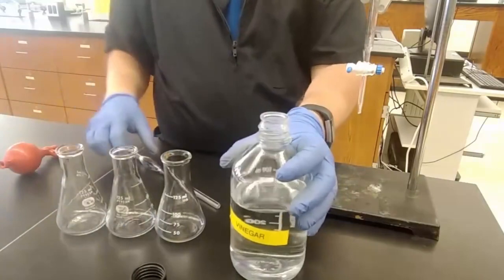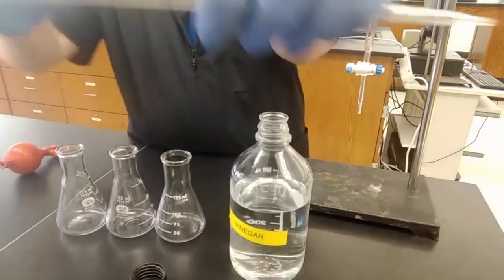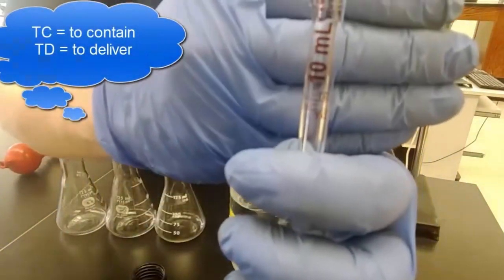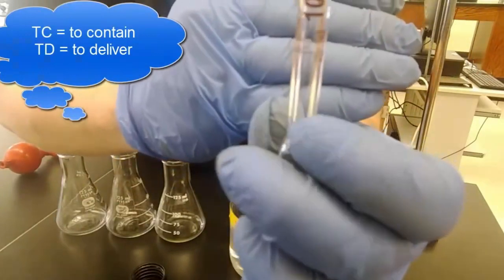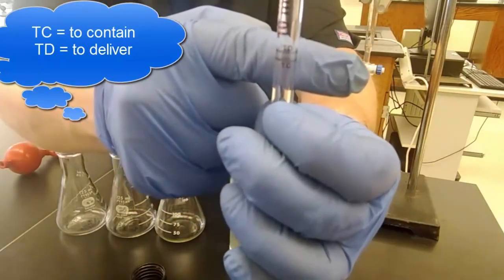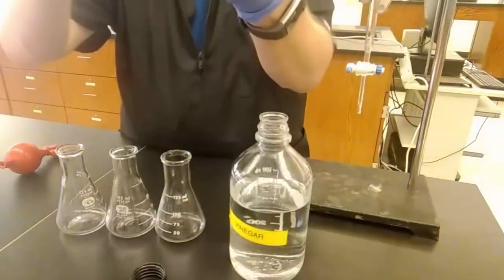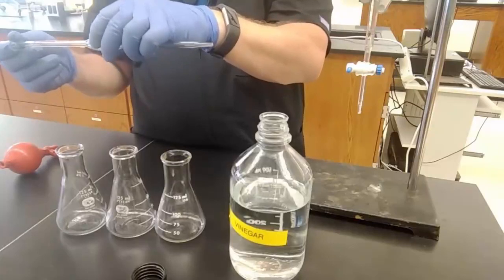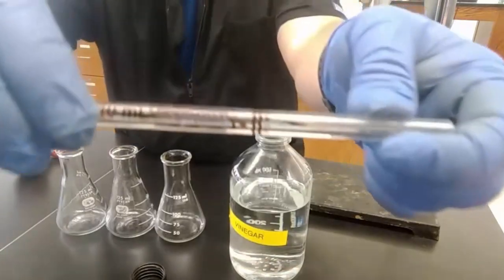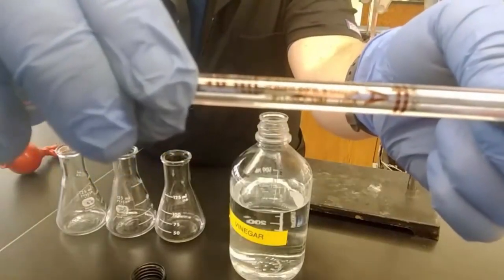So cap up like usual, and I'm going to use a volumetric pipette, which this one is interesting. It has both a TC and a TD line. Most pipettes are just TD. So that's the line that we're going to use because we want to deliver 10 milliliters. And on here, it should say what its plus or minus is. It's usually 0.02 milliliters. It's on there, but it'll be impossible to read on the camera. I'll try and show it to you anyway. Plus or minus 0.02 milliliters. So a very, very precise measuring device.